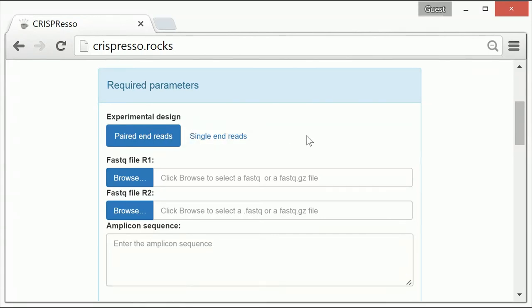If the paired-end reads option is selected, you should have two fields to input FastQ files, while you should have only one field if you have selected the single-end reads option. Now, I will upload both sequencing files.